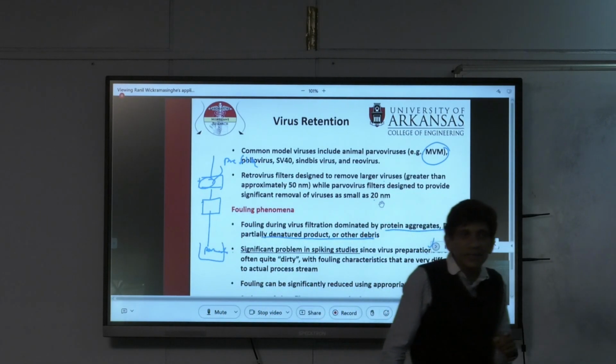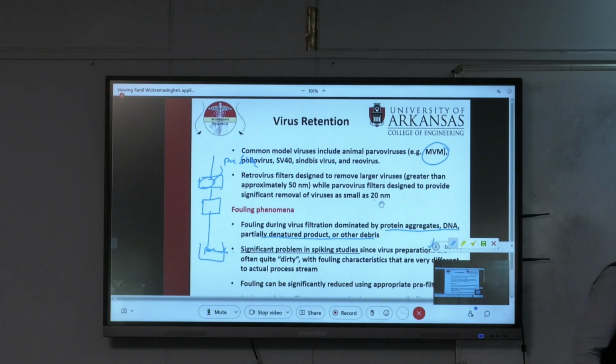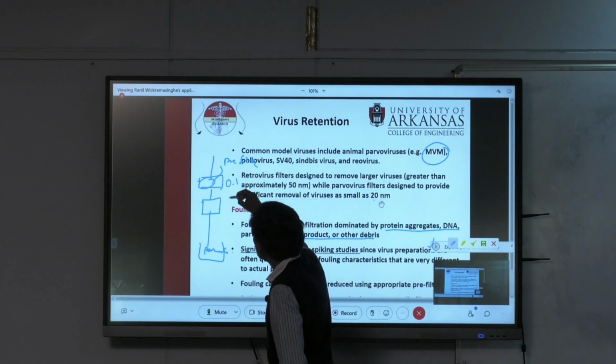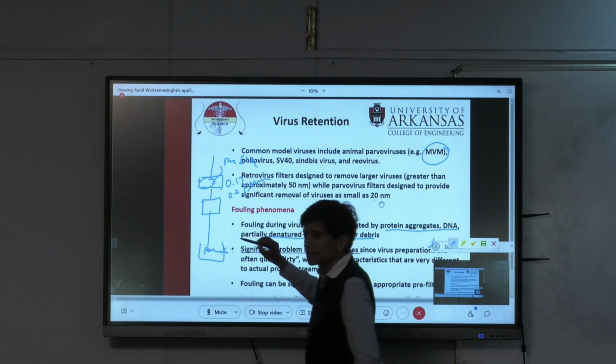We talked about this yesterday. We said basically you always have a sterile filter in any process, right? So the simplest type of pre-filter would be, say, a 0.1 or a 0.2 micron sterile filter. Okay, that's the simplest.